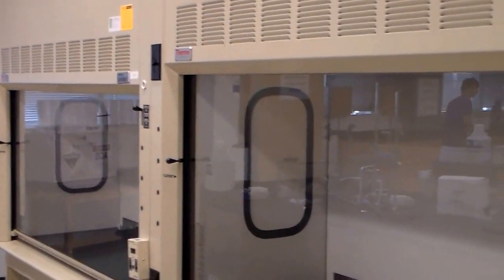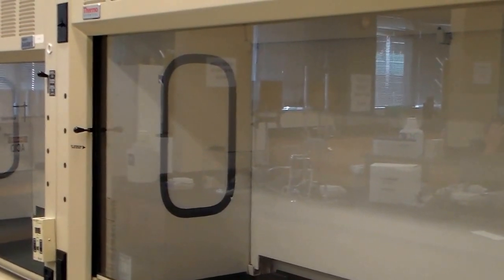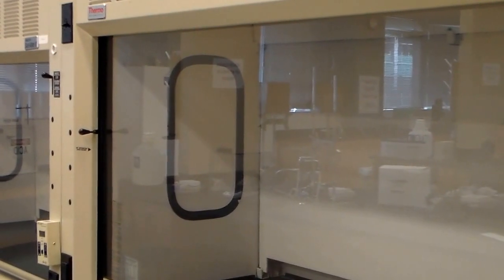You can see we have hoods on the side of this lab here. Four hoods on that side of the room. Those hoods are used typically for picking up your supplies. We generally aren't going to do anything in chemistry one that's serious enough that you have to have fume treatments, but this is how we keep the fumes out of your face.